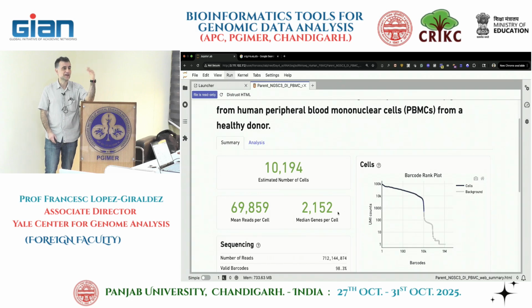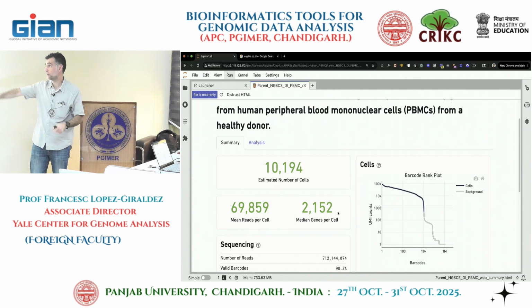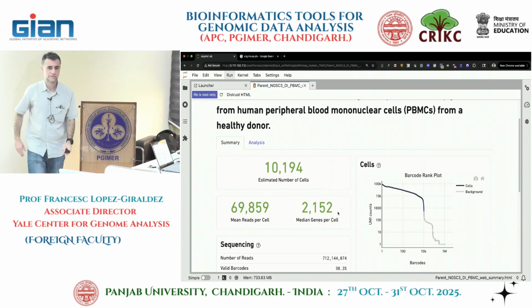When we say 30X coverage, when we talk about how many times you see a base in the genome, this is completely different. You don't have to think in those terms. I was trying to find an analogy when we talk about coverage, right? So we look at cell level only. You don't estimate any kind of genomic coverage or anything like that. Okay, so the data looks good, enough to do an analysis.